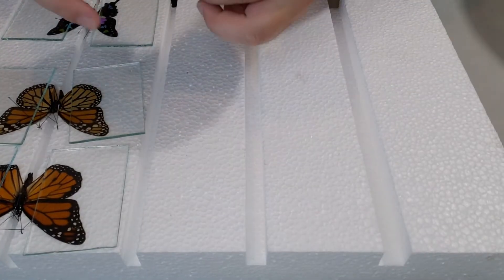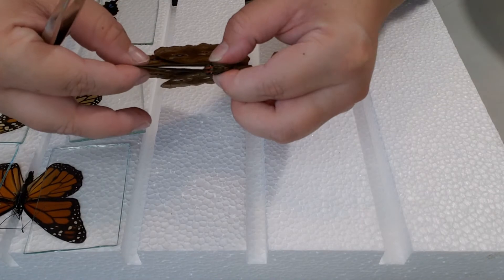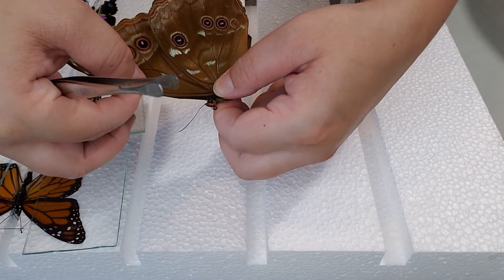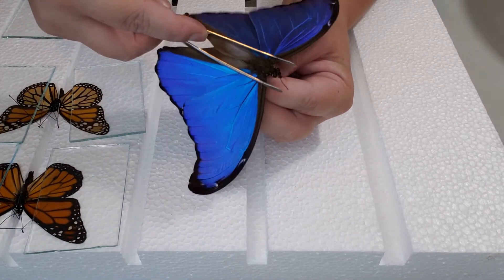Something to keep in mind about blue morphos, especially the Morpho Didius which is the bigger one, is that sometimes the wings are so big that the glass won't completely cover the wing. The upper corner of the forewing will kind of be left over the side of the spreading board, so you can cause crease marks that way. Just be careful when laying down your glass and when taking it off.